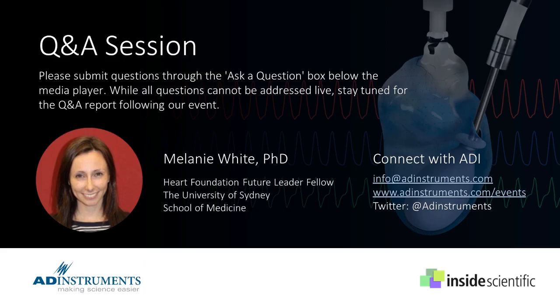So there's some sort of extra factor happening in that heart. Maybe there's too much calcium that's allowing it to contract with significantly more force, that's responding in a maximal parameter, which should be considered for exclusion. So definitely minimum and maximum exclusion criteria are important for Langendorff experiments, but especially for ischemia reperfusion, where we're looking at how they recover following that insult.